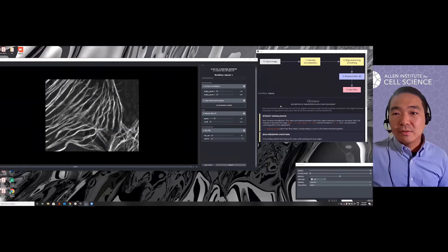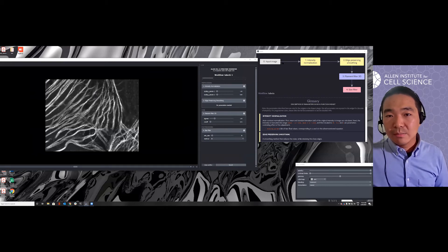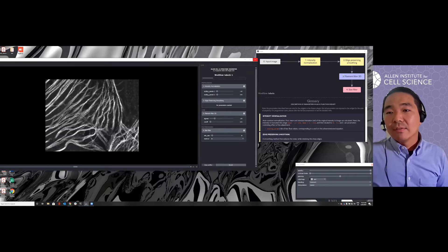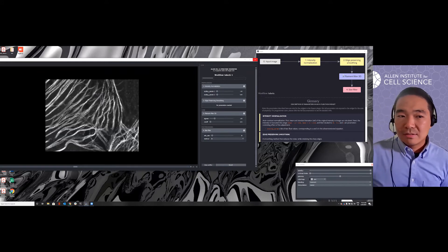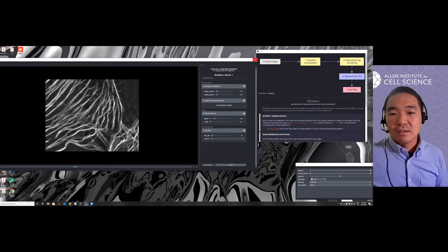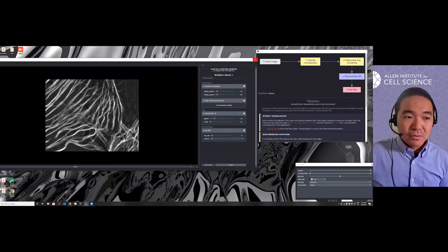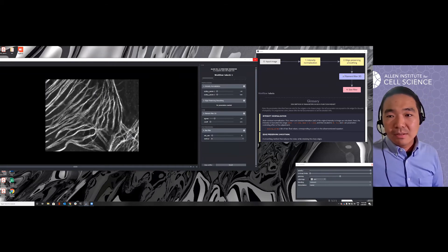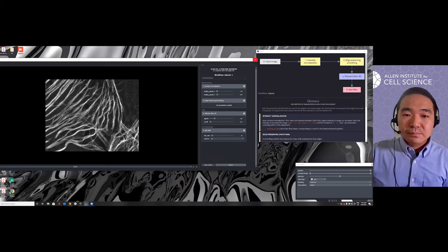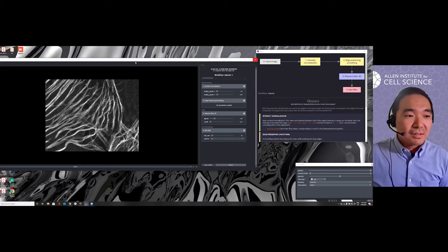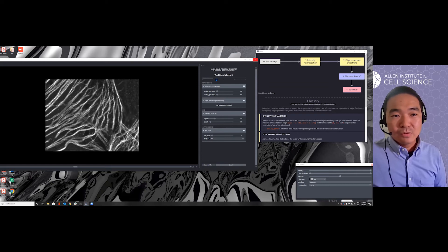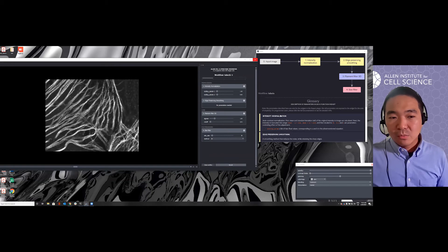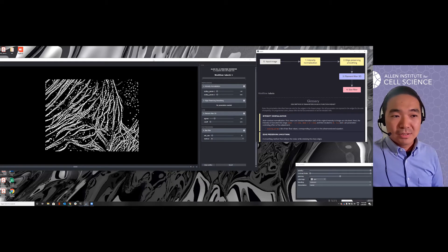So basically, this is a very simple workflow. We just take the input image and do some intensity normalization and smooth it and apply a 3D filament filter. Then we apply a size threshold to remove those small pieces segmented due to the noise. Usually it takes like 30 seconds or so depending on the size of your image. You can see the progress bar as it's moving forward, and if you want to understand which parameter is doing what and which function is doing what, you can go to this documentation on the right side.